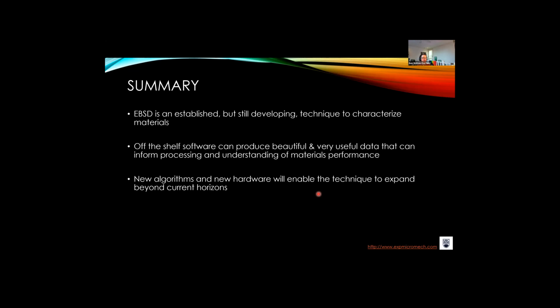It can be used relatively routinely for grain size assessment and a whole range of other bits and pieces, and they're beautiful and very useful, and the software manufacturers have done a lot of work to make that possible. Increasingly, as we get access to the data and there are open source algorithms, we can start to do even more to push the techniques and solve problems that are useful for society. So with that, I thank you for your attention and I welcome questions.